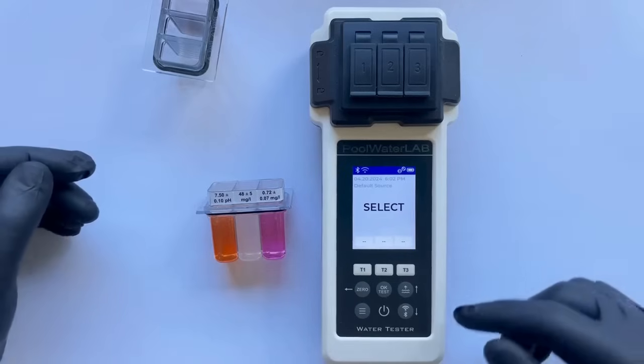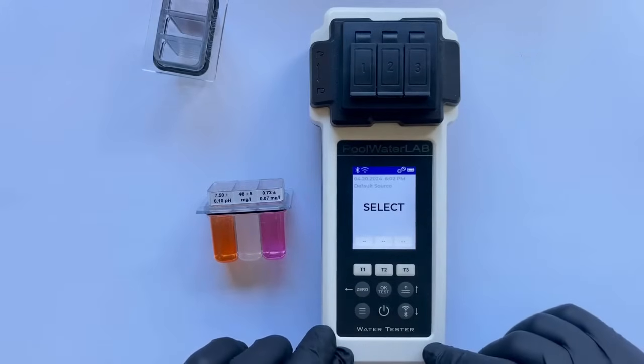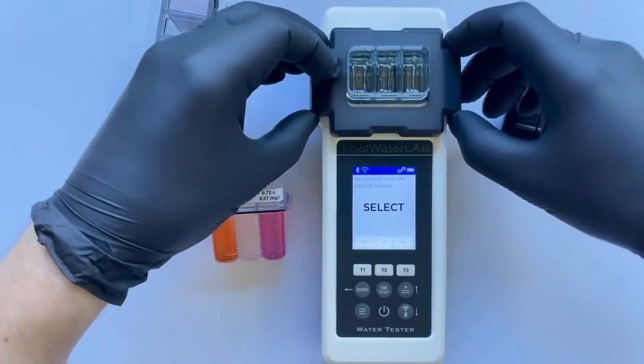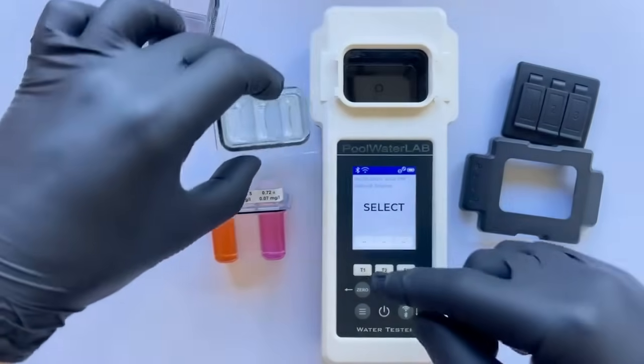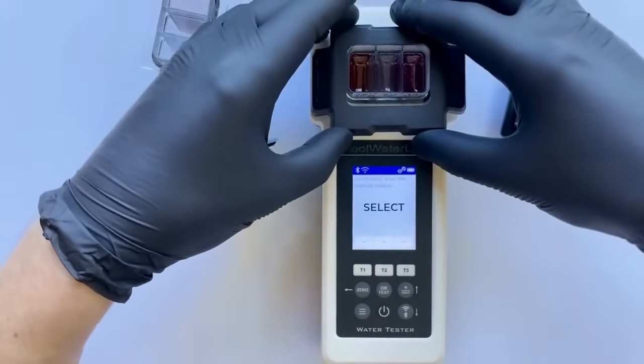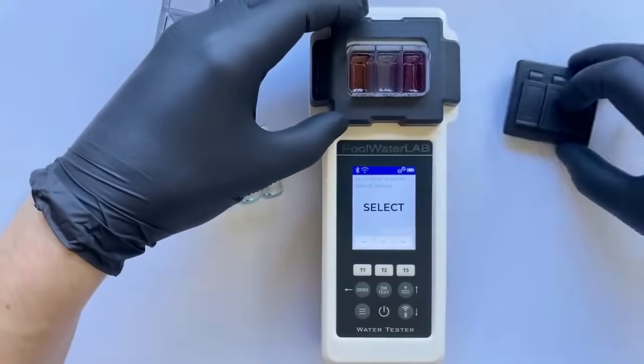Next, we'll set up the laboratory samples, which have been previously verified in a laboratory. Let's conduct the test now and carefully compare the outcomes. We'll analyze the results to see how they align with our expectations based on the pre-verified laboratory samples.